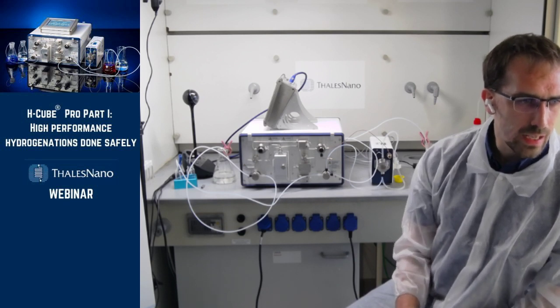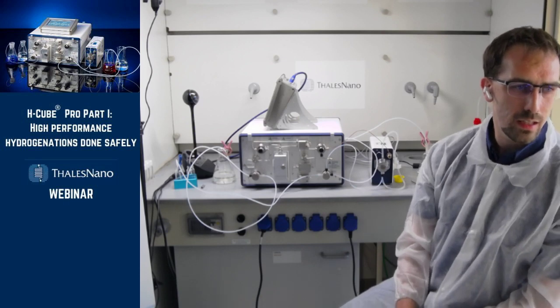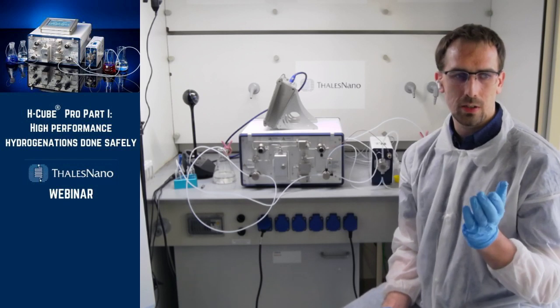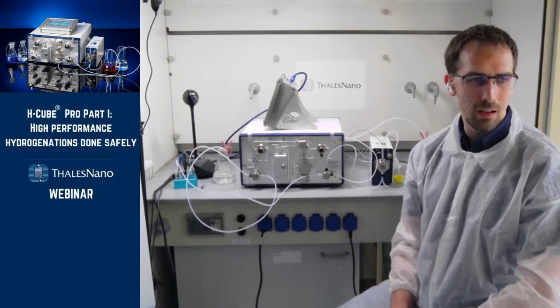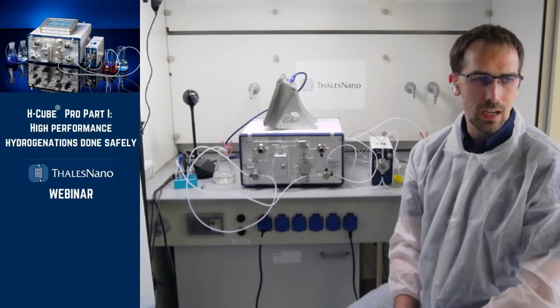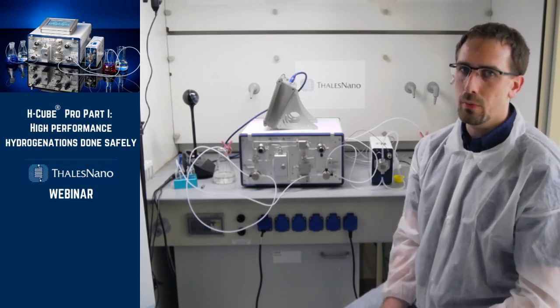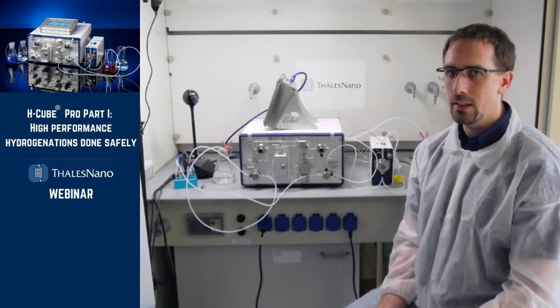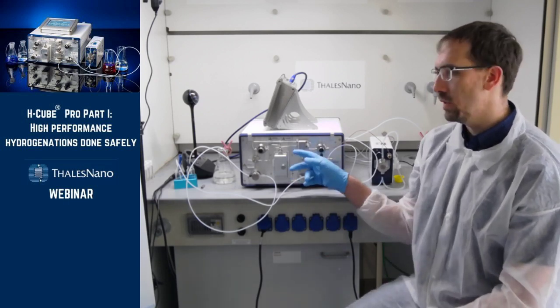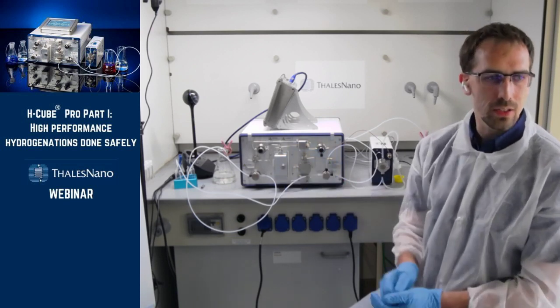What is the life cycle of a cartridge and how to identify the cartridge has lost its catalyst activity? So I just answered basically about the life cycle. How to identify that the cartridge has lost its activity? You need to monitor the conversion, and that's how you can gain information on the catalyst activity. So we have no way to analyze the catalyst quality inside the cartridge.